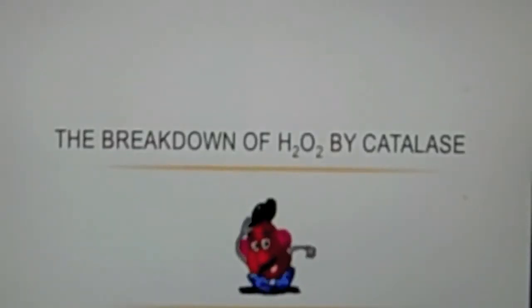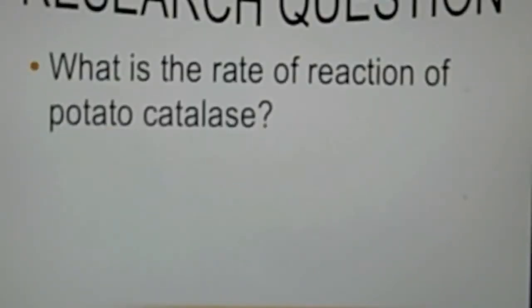Breakdown of hydrogen peroxide by catalase. The main focus of our lab was to find the rate of reaction for potato catalase.